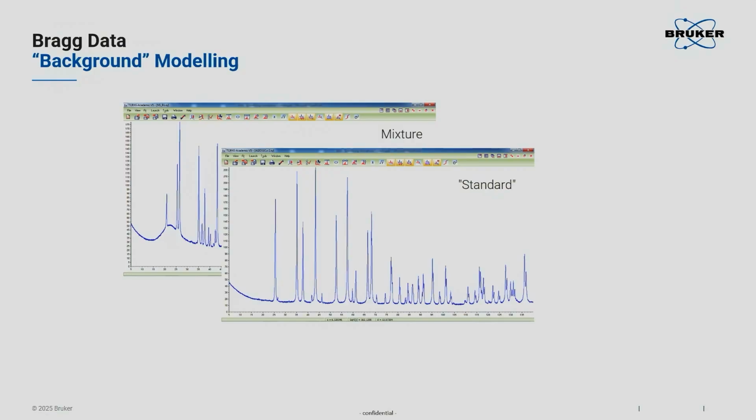So, what can I do here? I can get a very good idea of what my instrument background is if I measure the standard, and if the instrument remains unchanged between my measurements, then I can use that as a constraint in all my other subsequent measurements.